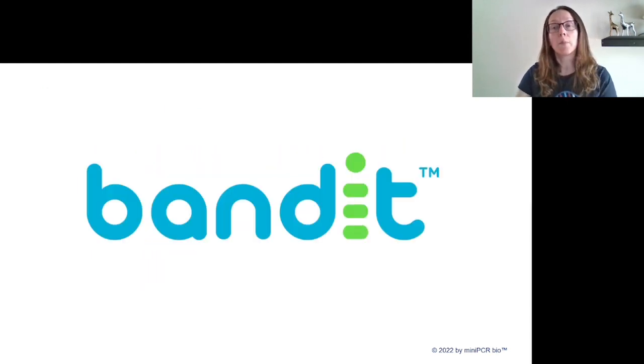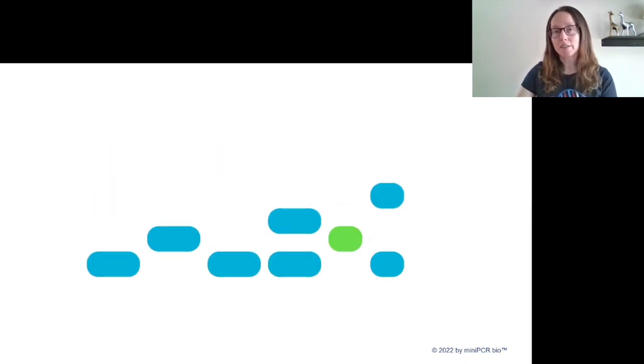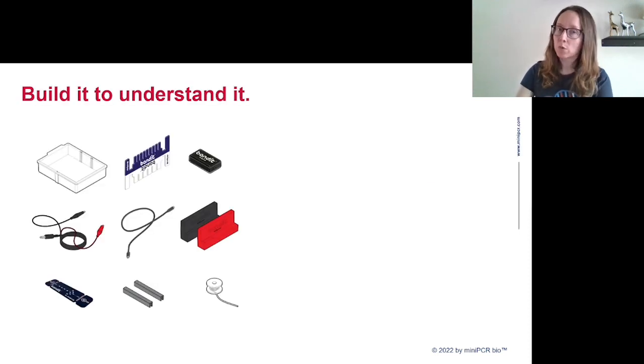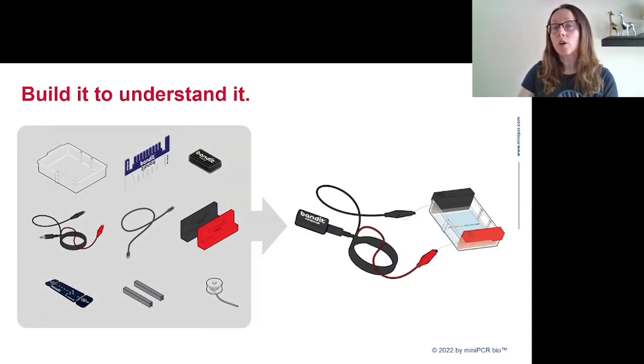I'm going to be introducing you to our brand new Bandit electrophoresis system. This is the result of our effort to make a system that teaches students electrophoresis from the inside out. With Bandit, understanding the science of electrophoresis is an inherent part of using the system. Bandit was designed with a build-it-to-understand-it approach. It's a kit that students use to build their own electrophoresis system and then use it to run an experiment.